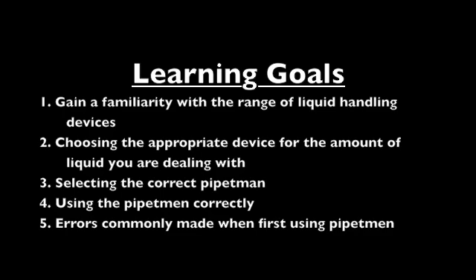This video is designed to give you an insight into the range of liquid handling devices available to you within the biochemistry teaching lab. Secondly, to help you choose the appropriate device for the amount of liquid you are dealing with. This video is especially concerned with selecting the correct pipetman for the volume you are pipetting and how to use the pipetman accurately. Finally, there's a section on errors commonly made when first learning to use the pipetman.